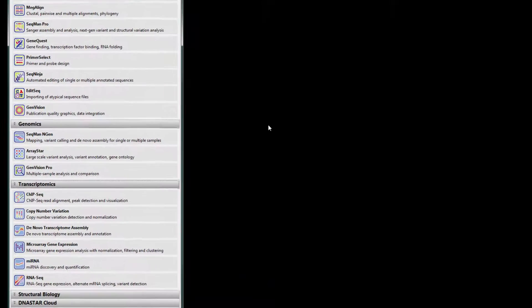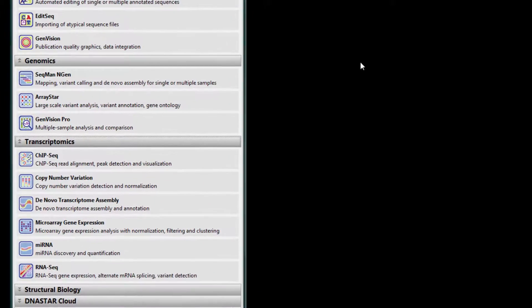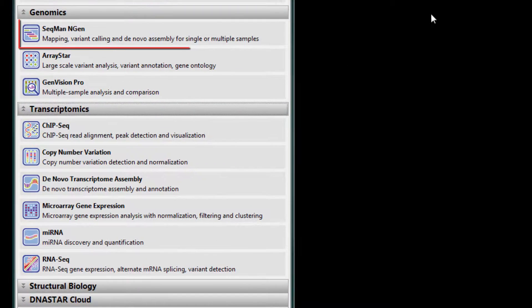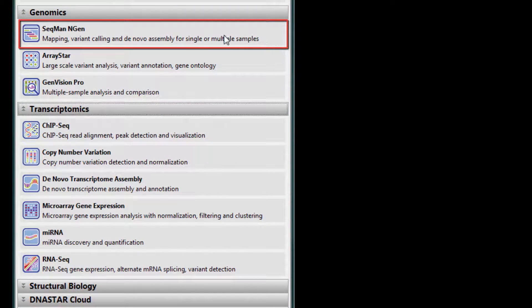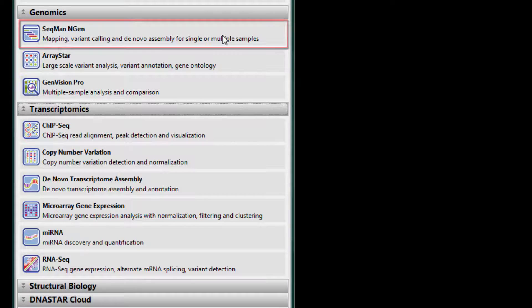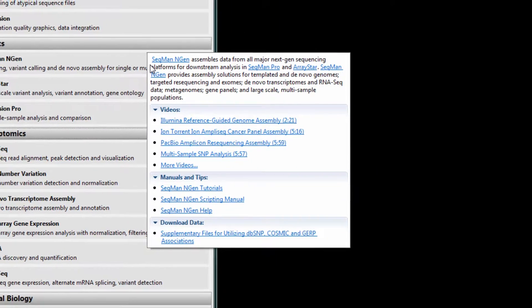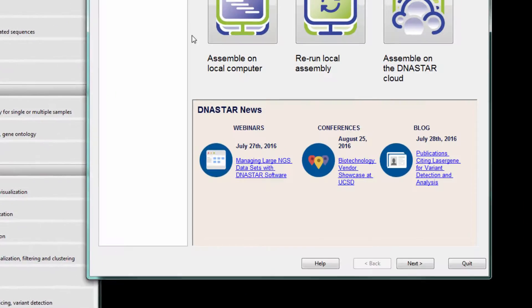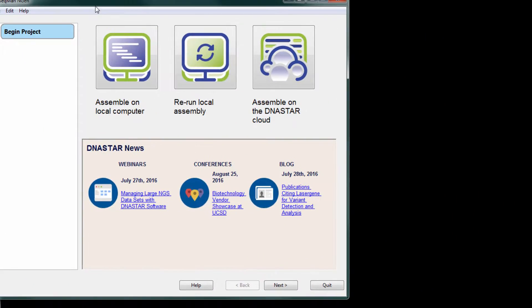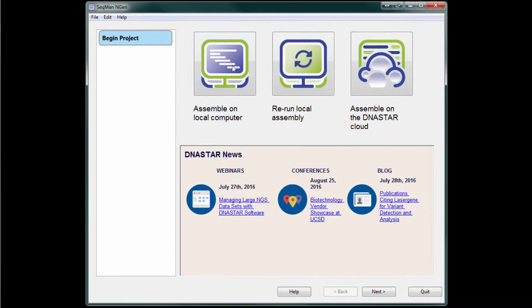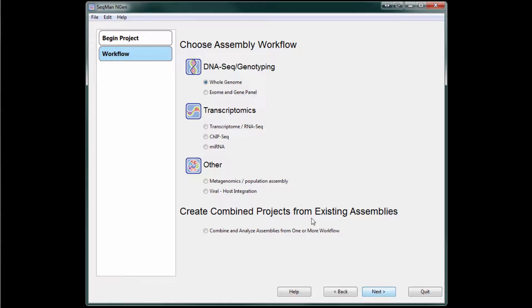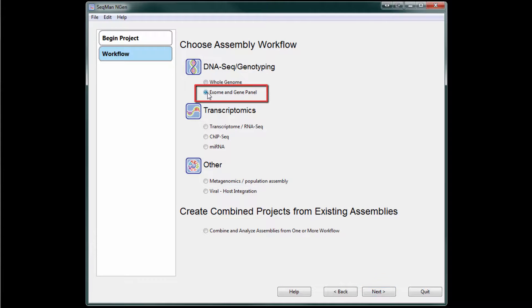To get started with Mendelian exome or gene panel analysis in LaserGene, first create a new assembly in SeqMan Engine. Next, select the exome and gene panel workflow.